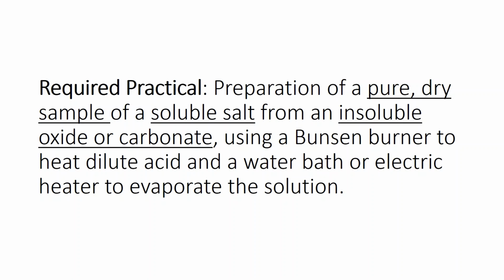This time, Year 10, we're going to look at a GCSE Required Practical. We've covered this already in part of a previous video lesson, but today I'd like to show you a video of the specific steps. So the Required Practical is titled Preparation of a Pure Dry Sample of a Soluble Salt from an Insoluble Oxide or Carbonate using a Bunsen burner to heat dilute acid and a water bath or electric heater to evaporate the solution.